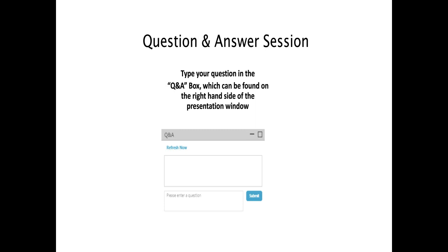Thank you. And next question. How long is a HILIC column able to sit in mobile phase? Thank you. That's another good question.